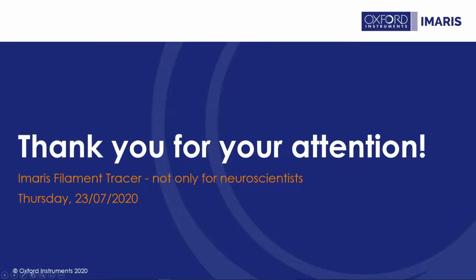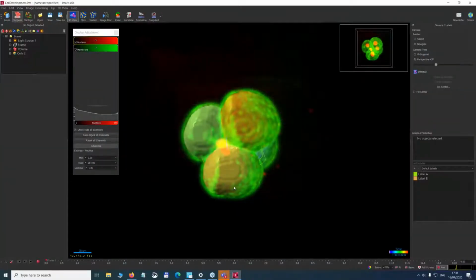So we've had a few questions come in, and I just want to make sure that we cover those. From Celine, she was asking, can we do image pre-treatment directly in Imaris without having to go into another software, before we enter the cell object and go through the segmentation within the cell creation wizard? Can you tell us a little bit about that?